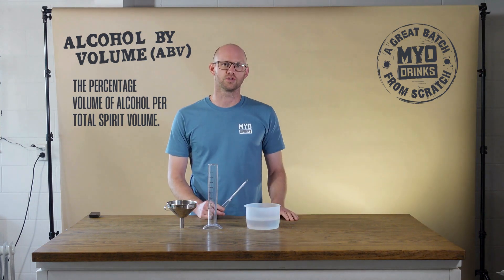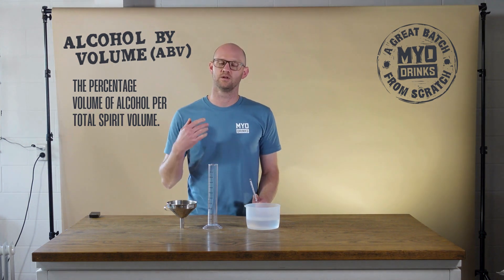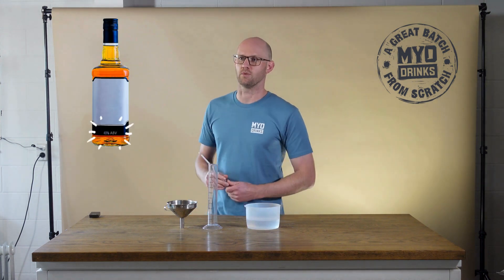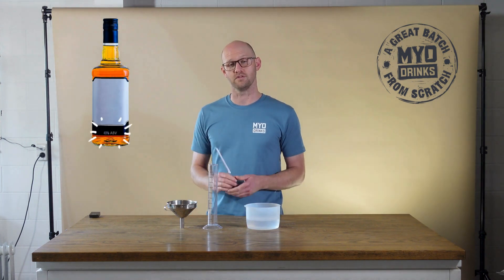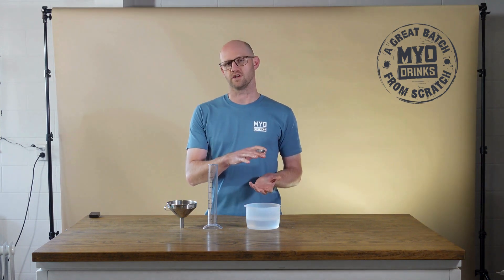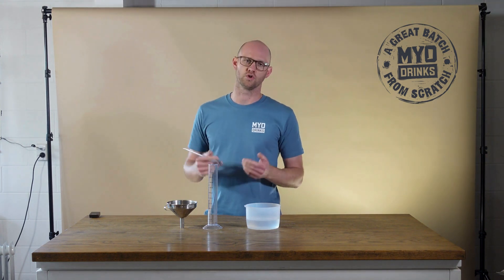This is also how commercial companies display their percentage strength on their bottles of spirits in store. You may notice a bottle of spirits will say 40% ABV on the bottle, and that means that 40% of the contents is alcohol and the remaining 60% is water or congeners.